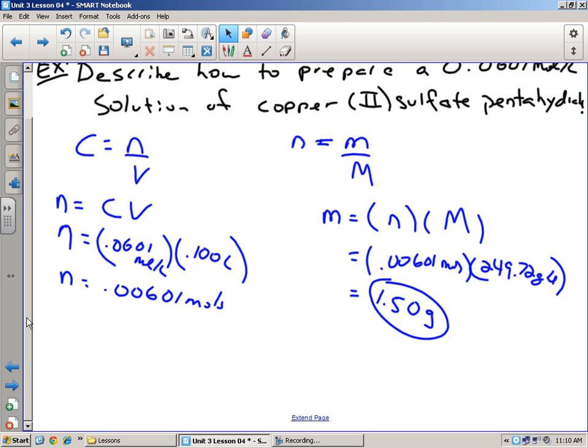So here we go. Now, the only thing about the calibration line is this. I need a little more water in here. You could just take it off and pour it, but I'm trying to deal with it later. So you're going to fill it up to the calibration line. Once again, we'll talk about that in a second. I left it a little bit short of the calibration line.